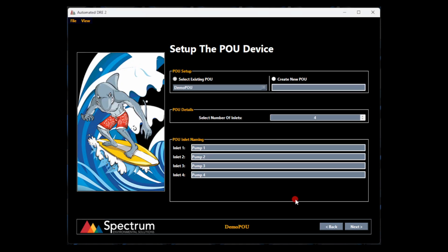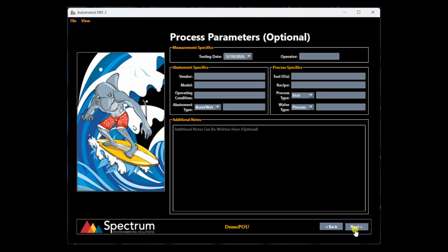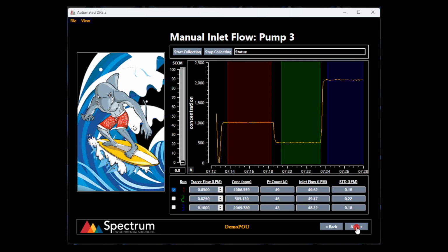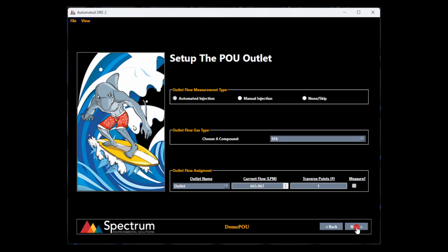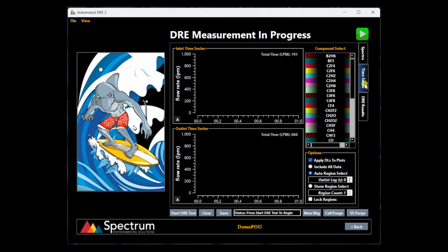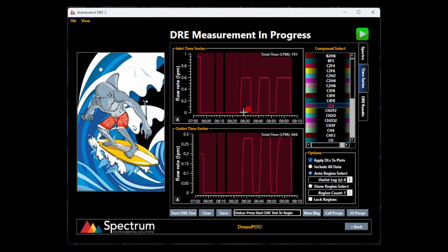So I'm going to hit accept, and it's going to load everything in just the same as it does, and we're just going to step through just like we did in part 2. I would refer you to part 2 of this series for more detail on all of this part. But then when we get to the end here, just to prove that in fact we have, you'll see what I did with these files is I actually just put in a bunch of fake numbers here at the beginning, just to prove that this is in fact a different file than what we were examining in part 2.